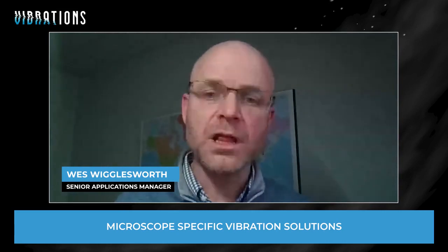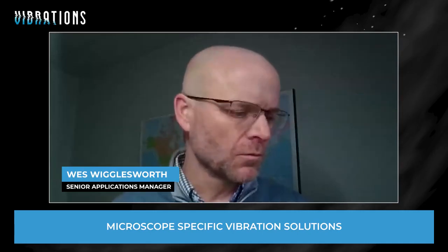So there are tricks to really capture what's happening at 1 hertz and 2 hertz, by changing the resolution of the spectrum analyzer and things like that, and also using the right kind of sensors. We do it ourselves, and we work with consultants that are out there. The manufacturers themselves have a lot of experience. But that's the key, again, going to that survey.